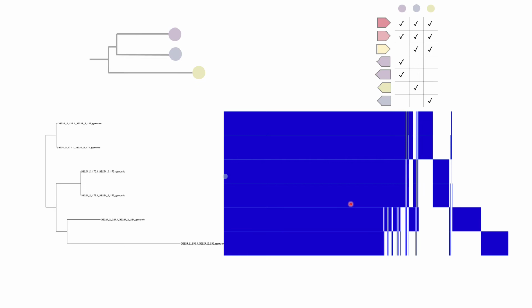As I mentioned, our blue blocks here represent gene presence and the white gaps are absence. Hopefully what you can see is that we have lots of blue to the left, and those are core genes. And then as soon as we start losing shared genes, those are our accessory genes. Like my schematic example, we do have here roughly a 50-50 split of core and accessory.